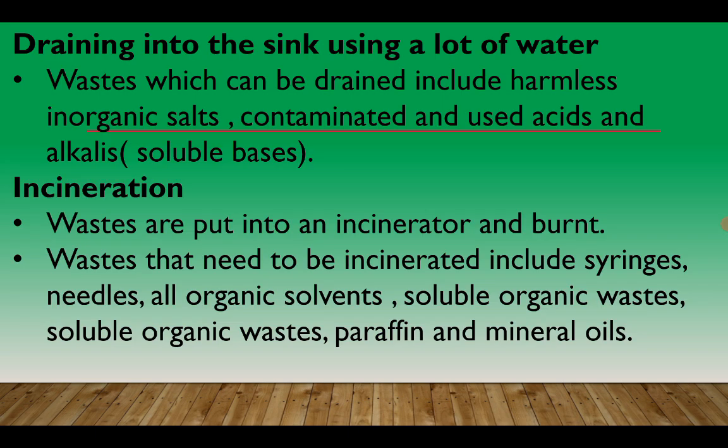Another way to dispose of waste safely in the lab is to drain it into the sink using a lot of water. There are certain wastes that do not need containers. All you have to do is drain them into the sink using a lot of water. Usually your laboratories are fitted with a water sink and a network for running tap water, so that you can either wash your hands or drain waste into the sinks placed under the taps.